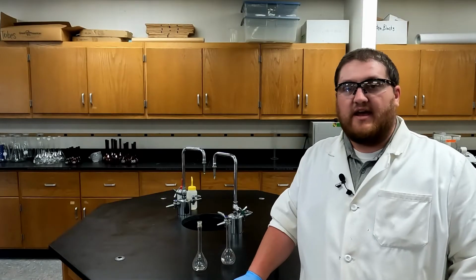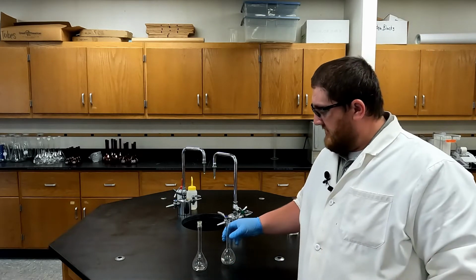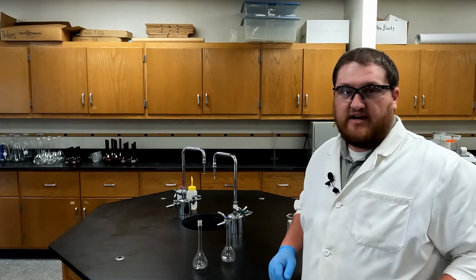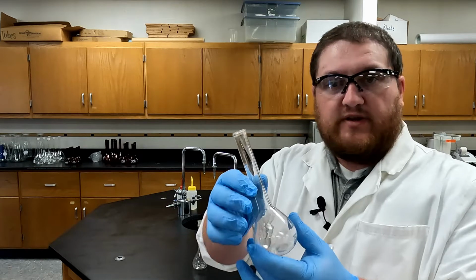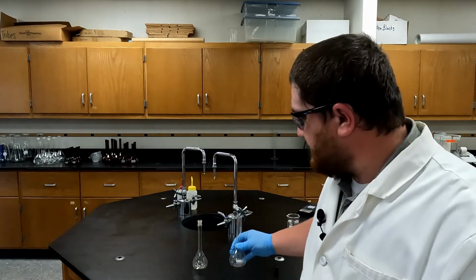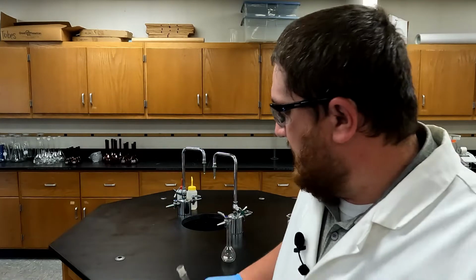Now that we've looked at how to calculate how much of our chemical we need, let's look at how to set up our station before we measure out our chemical. The first thing we're going to need is a volumetric flask, and we've got a couple different styles for these. We have this one, which has a nice smooth top, and we have this one, which has a ground glass joint.